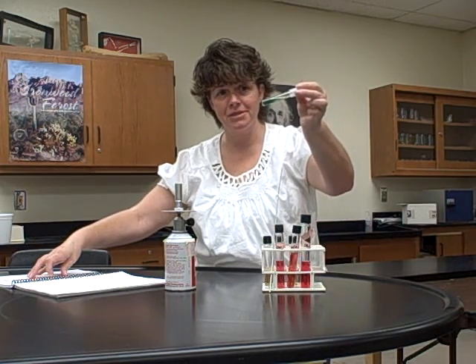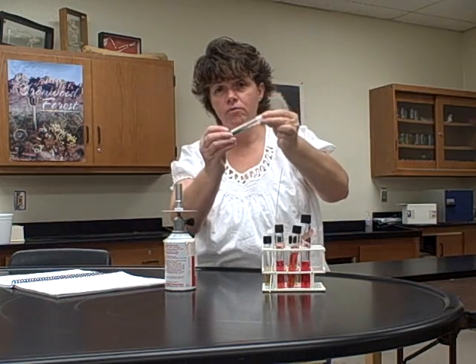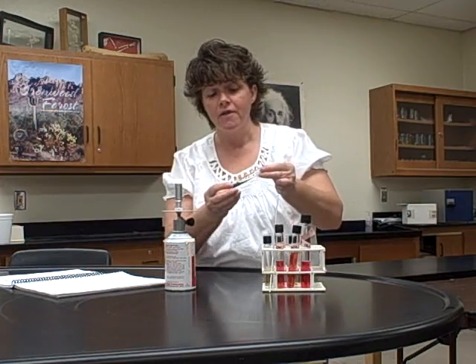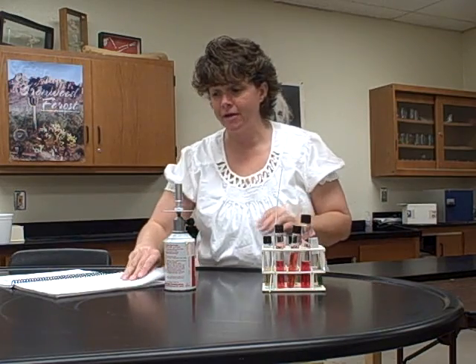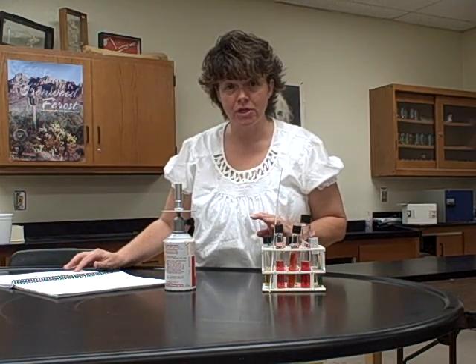So this is the Simmons citrate tube. You notice that it's an agar slant, and it starts out green. If that bacteria is positive for citrate, then it's going to turn it blue. So that's going to be an addition. You'll have to make a note in your lab manual on page 93 where we're starting out, to add the Simmons citrate tube.